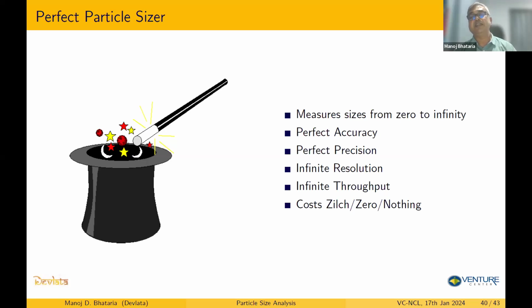For example, you might be selling a chemical or powders to somebody, and they would like the analysis to be done on a specific instrument or a certain type of instrument. So get this information from them and then do the analysis on a similar kind of instrument. Otherwise, if you buy a sedimentation instrument and your customer is expecting results based on DLS, then there will be a mismatch. Those two instruments may not give you the same size. It may give the same size, it may not. So you have to be very careful regarding what kind of instrument and technique you are using.